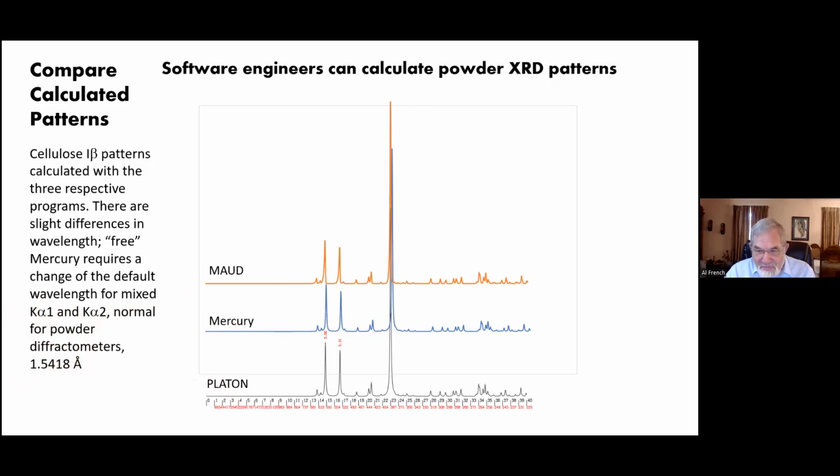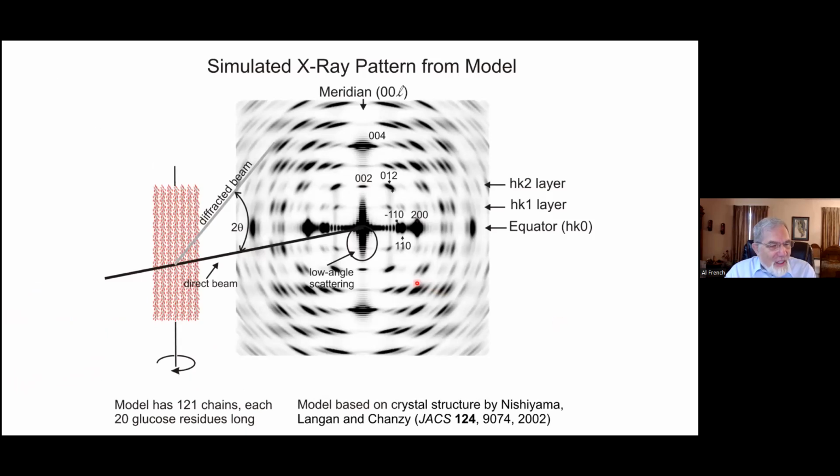Anyway, people know how to calculate powder diffraction. There's a widespread agreement on that. Now, this is a fiber diffraction pattern, and this is a model crystal here. It's actually a modeled pattern from work that I did with Yoshi Nishiyama a few years ago.